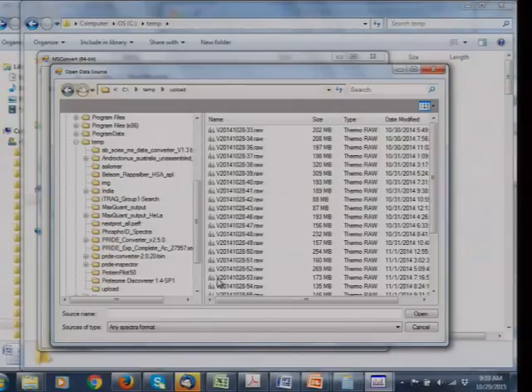We're using the software. Yes. So, you go to the home page. There are video tutorials. These are all focused on, there isn't one that's focused on glycopeptide analysis, but it's mainly focused on peptide analysis in general.